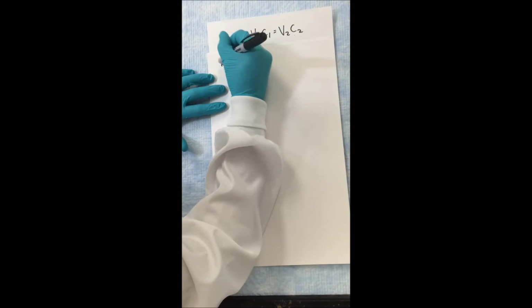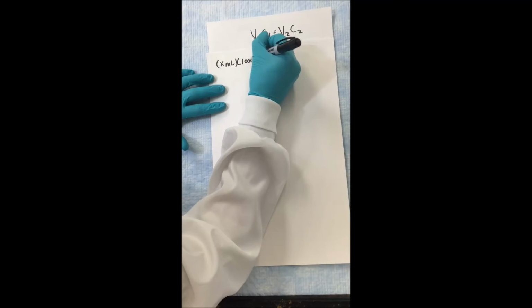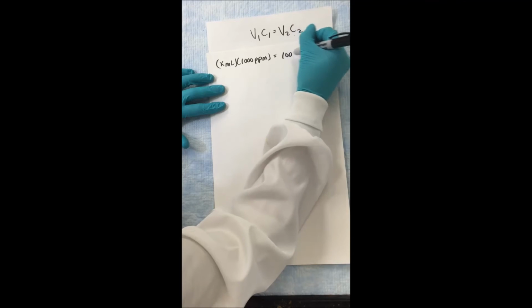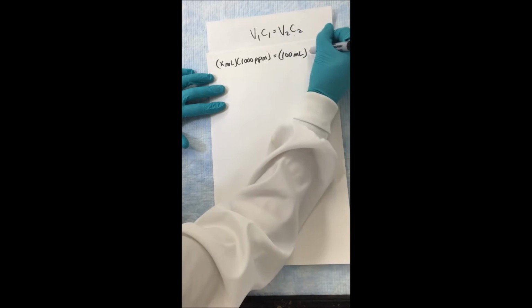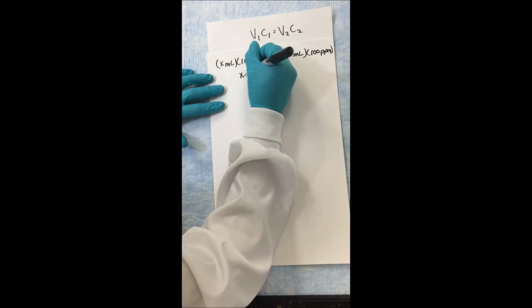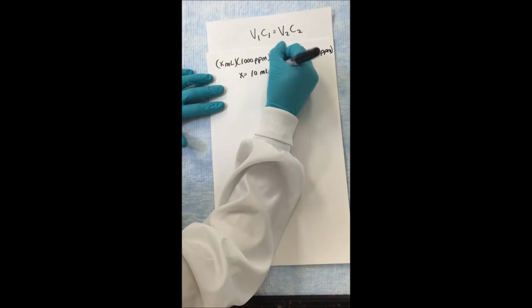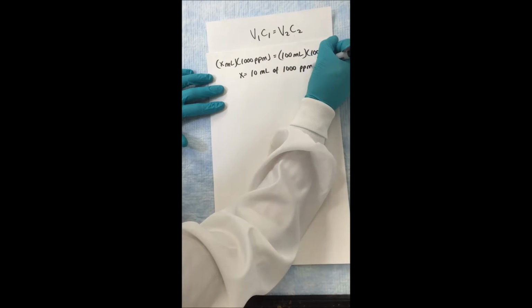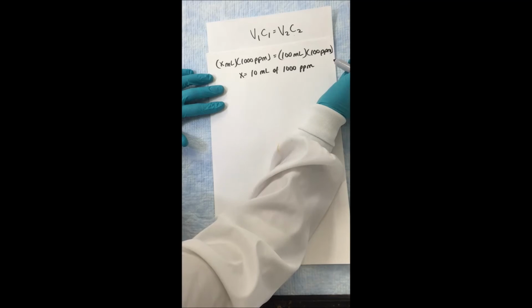Using V1C1 equals V2C2, we are going to solve for X here to determine how much concentrated stock solution we will need to make a 100 part per million ammonia standard. Solving for X, we see that we are going to need to take 10 milliliters of 1,000 part per million solution to make 100 milliliters of a 100 part per million solution.